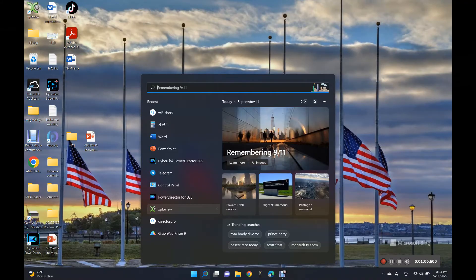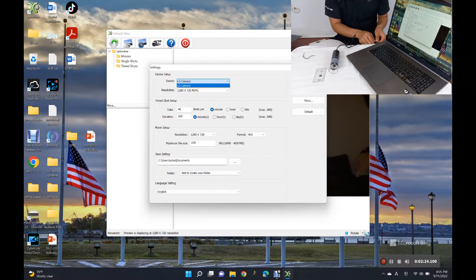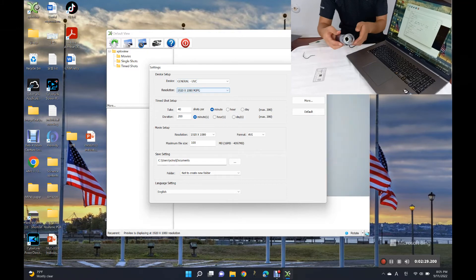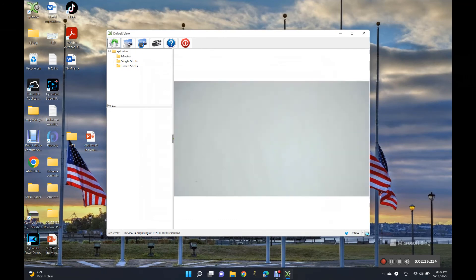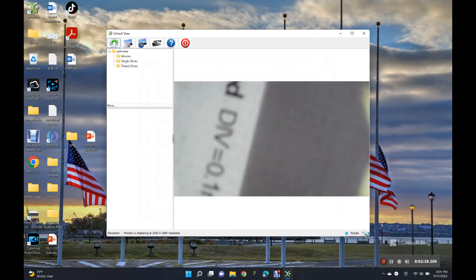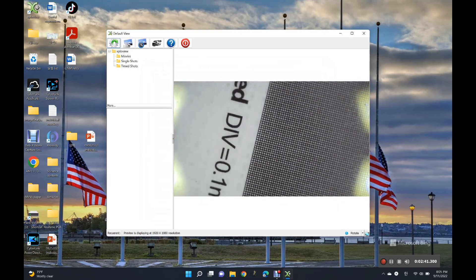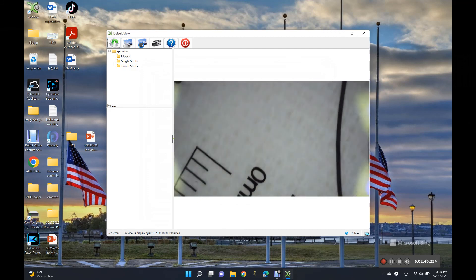I can also see it by connecting to my computer. When I connect to a computer like this, I could find the microscope in the device window. And when I clicked apply, I was able to see it on my computer screen as well. The microscope is really good value for money. I will make a lot of interesting content with this microscope — please look forward to it!